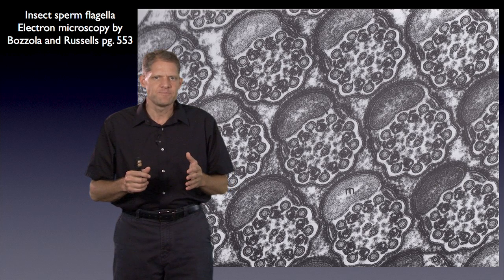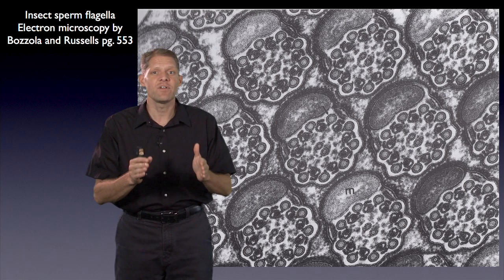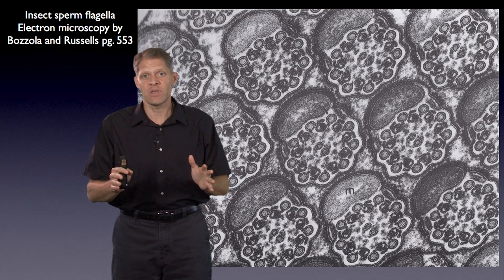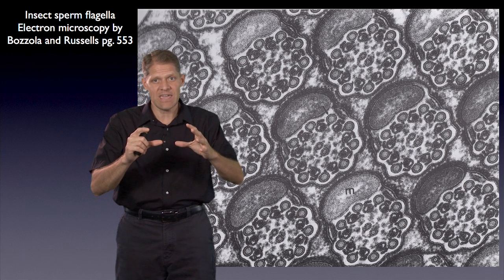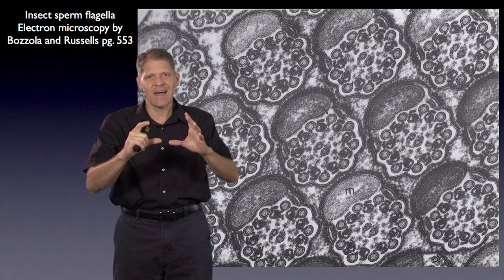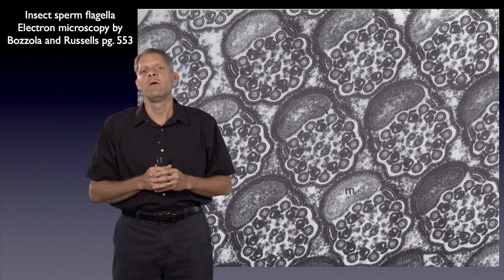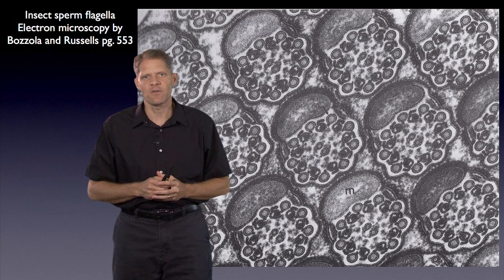But even if they did, if we were to crank up the magnification and illuminate it with enough electrons to see detail, those incident electrons would destroy the helices long before we could ever resolve them. Instead, we could crank up the magnification and see the stain, the metal atoms that are surrounding that protein structure. And we could see the metals at higher and higher magnification because they can sustain a lot heavier dose than proteins. But we wouldn't be able to resolve the internal details of the protein themselves.